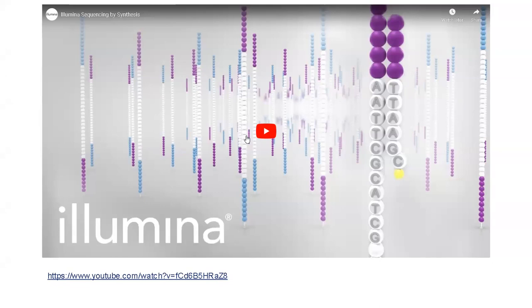Yes. So there are multiple steps during library formation. When you do a fragmentation, you might end up with different moieties, so then you do an end repair. One of the techniques that I am aware of is the TA overhang technique, where they specifically add a particular overhang at the end of these repaired ends, and once you get an overhang, you can then use whatever adapters you want to use. Okay, I understand. Thank you.